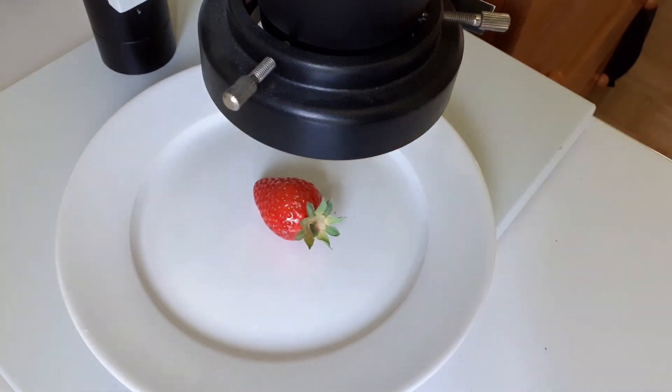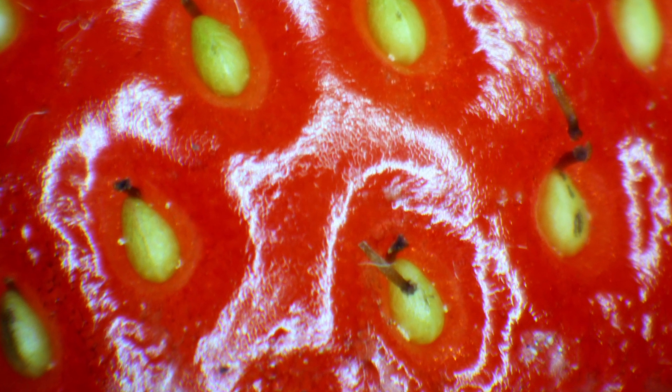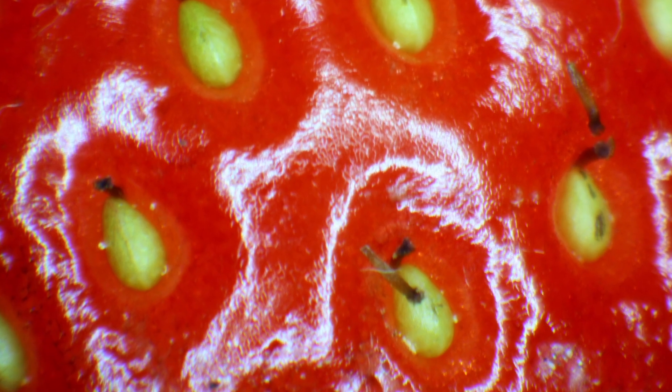Those stereo microscopes allow you to do very uncomplicated nature observations. You just take the specimen as it is, put it directly under the microscope, and you can look at it. You get an upright image and a stereoscopic image, and it's much more immersive. I think it connects the children much better to their environment this way than just giving them relatively abstract microscope slides. Of course, if you know a little bit more, those compound microscopes that do require microscope slides might give older children a little bit more possibilities to experiment around with.